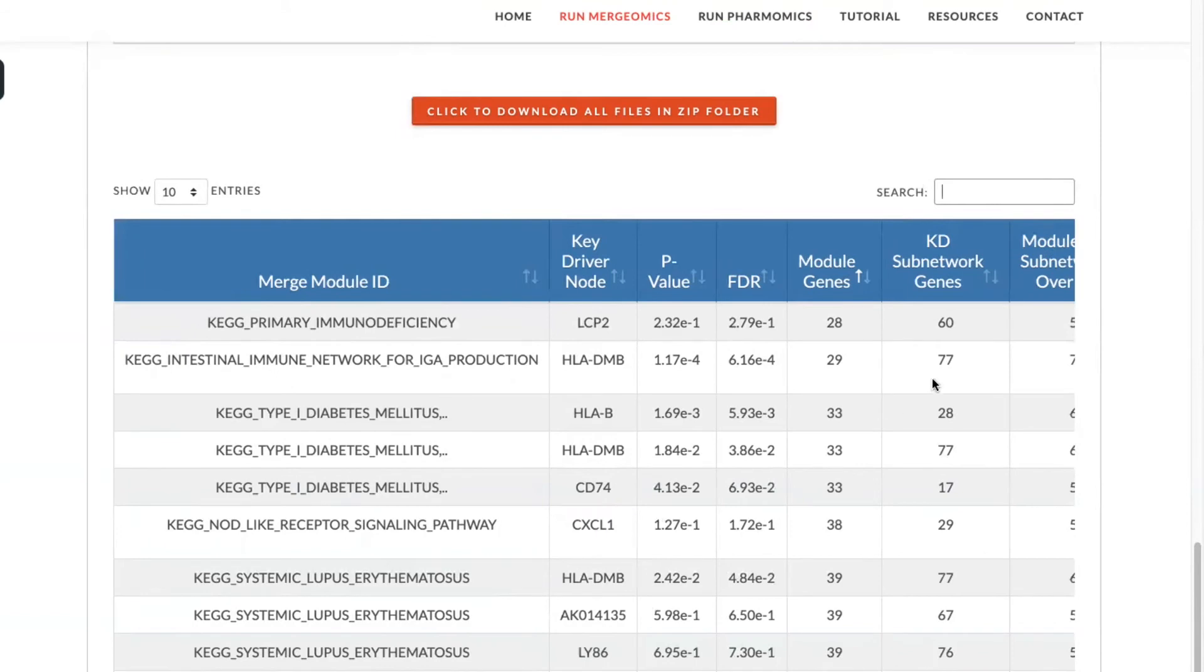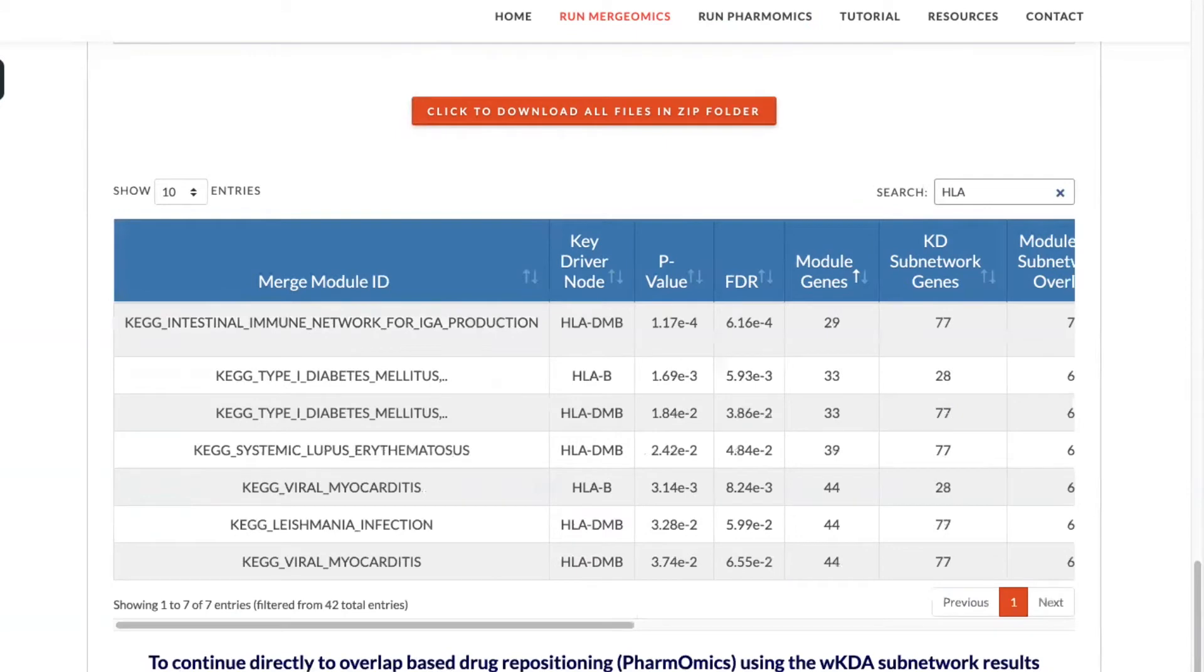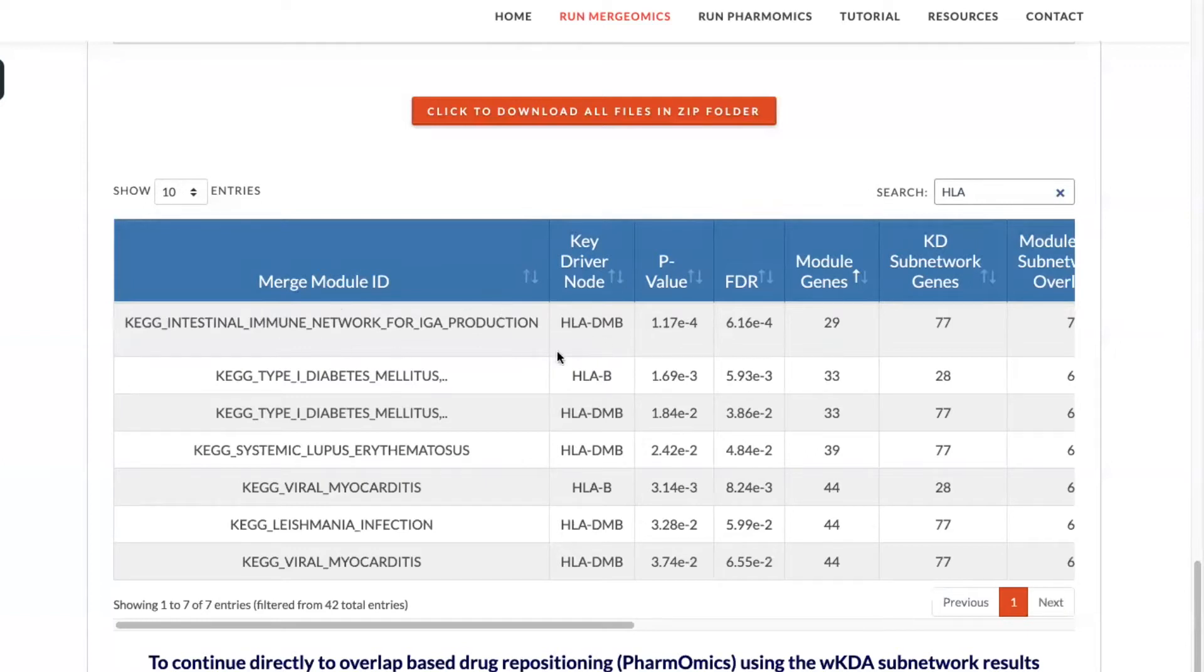If you would like to search for a gene of interest, you can type that gene in, where you'll be able to find information on the FDR and p-value of that given gene, as well as the pathway that it is associated with.